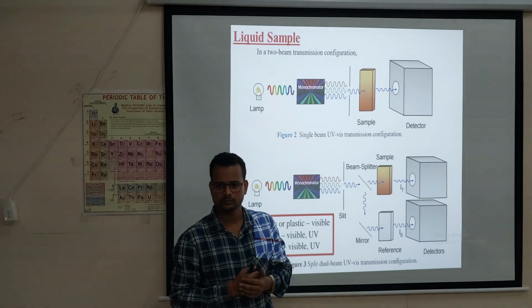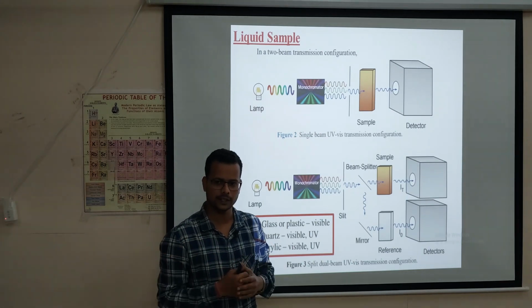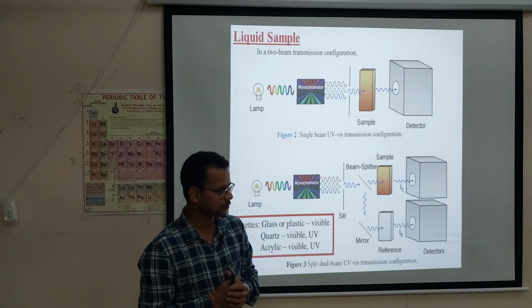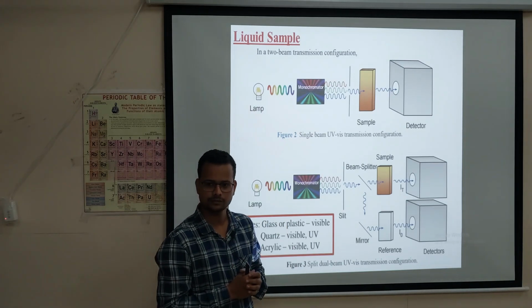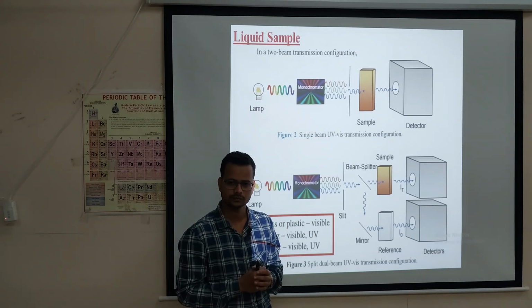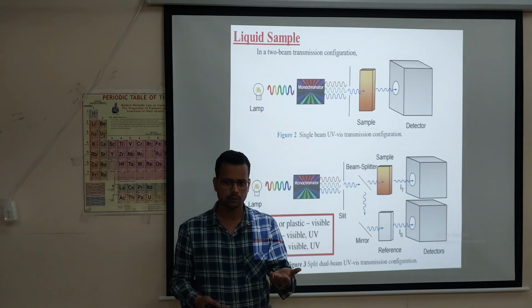My question is, a monochromator is used, right? That means maybe it will choose only one type of wavelength. In UV visible spectroscopy, we are taking a UV light source as well as a visible light source, so that's why we are using that here. I was confused that red, green and blue wavelengths are there, and out of these three, only blue passes. No, not exactly like that.